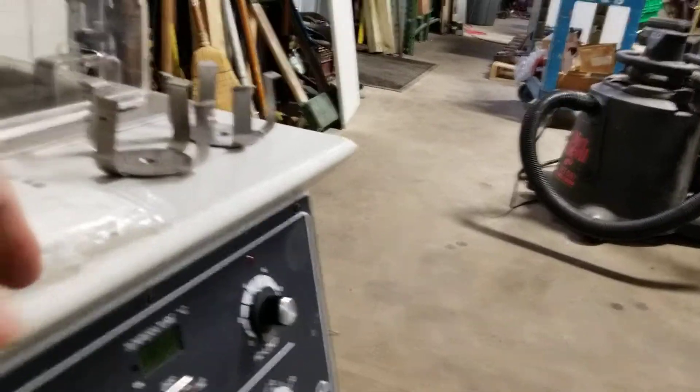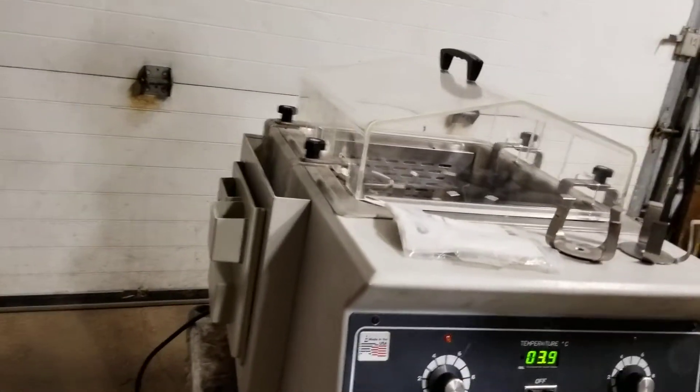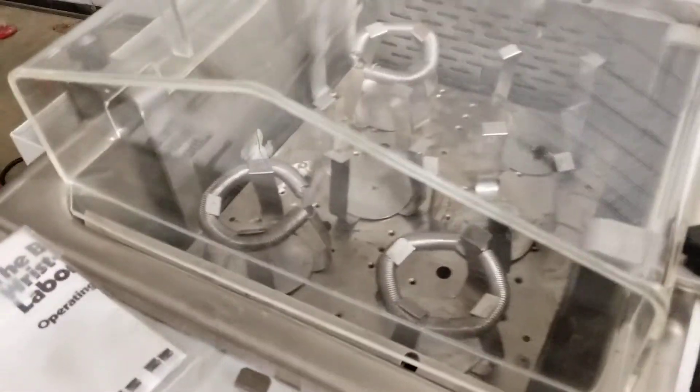We don't know too much about it. I'm not going to put any water in it, but why don't you turn it on. We've already tested this. Here it's doing some shaking — you can speed it up.